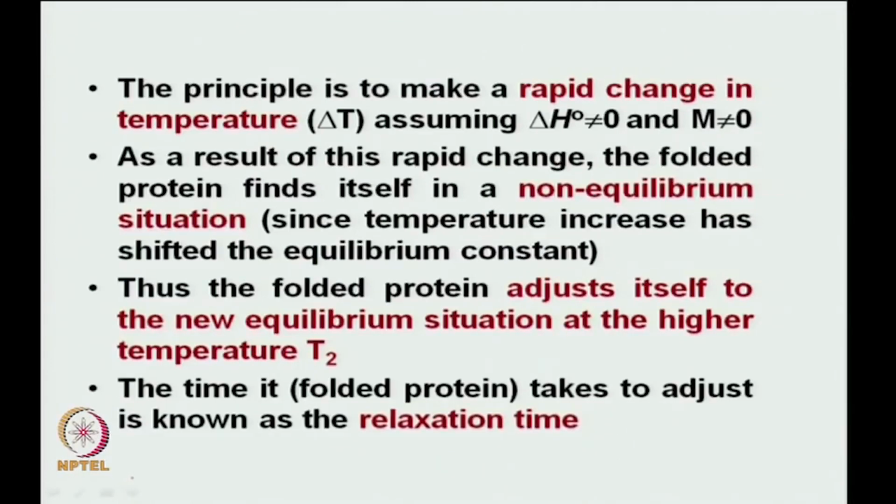And the time that the folded protein takes to adjust to this new equilibrium situation is known as your relaxation time. That is why it is called a relaxation method, because you are changing something and then because of that change the protein is relaxing to the new change. That is why it is called a relaxation method. Okay.